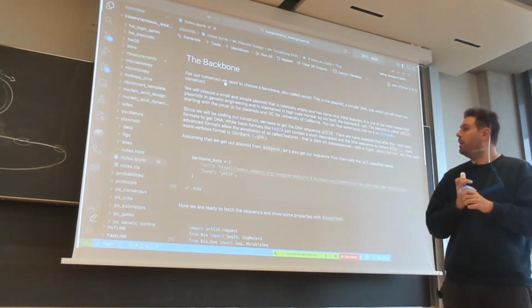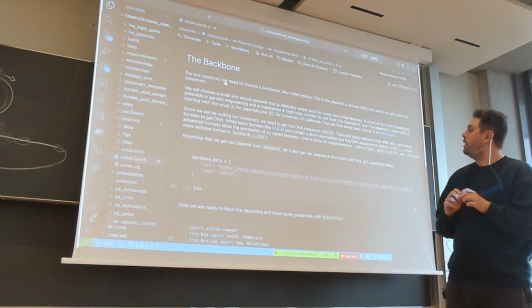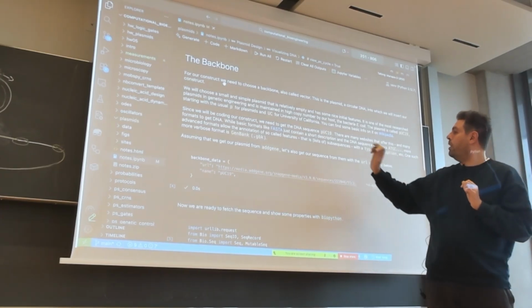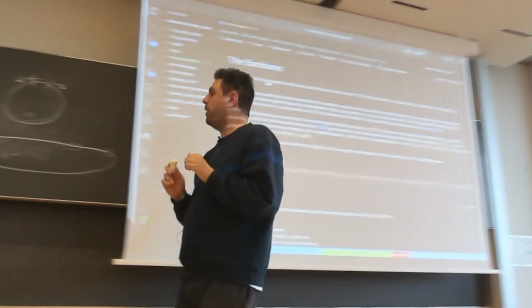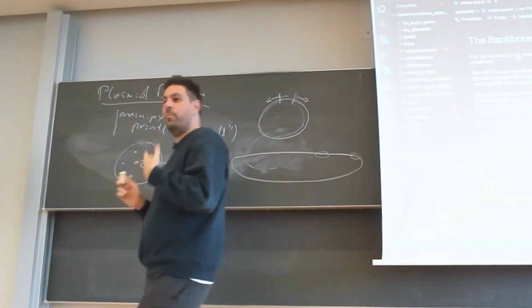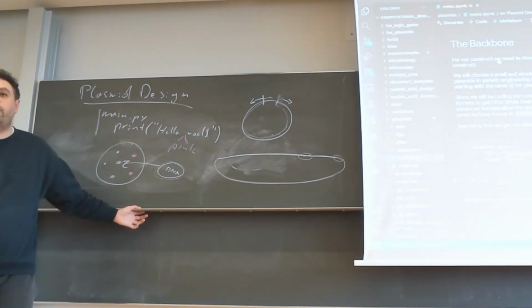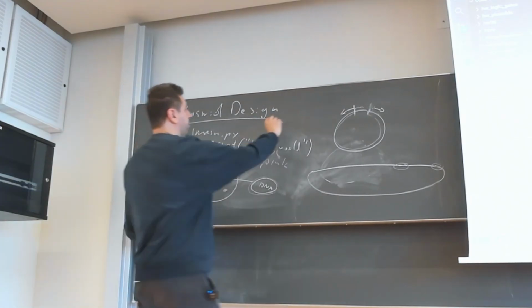We will pick very simple bacteria, and we will pick them so that they work with a plasmid that is very heavily used. So this is the pUC19 plasmid. I think we have that in our lab, for example, and most labs probably have that stocked. And if not, you get it very easily from Addgene, for example.